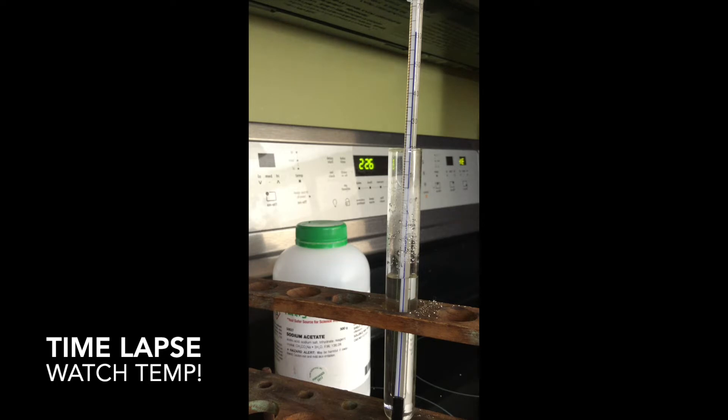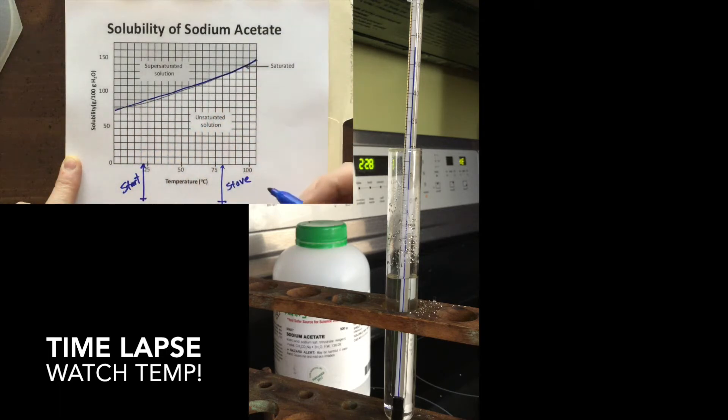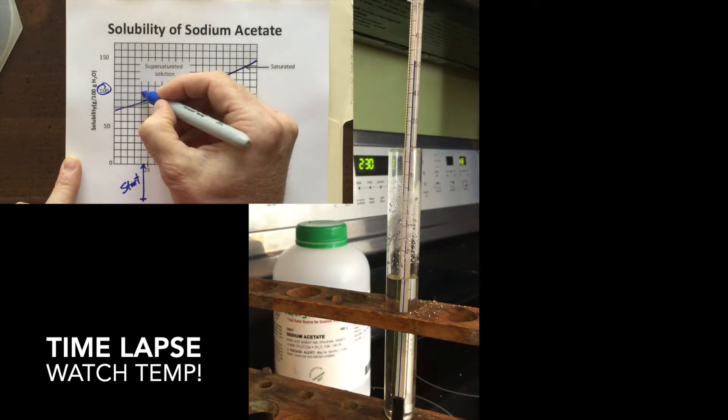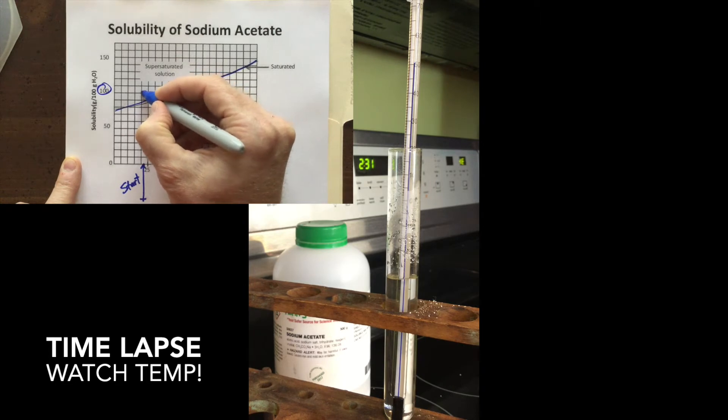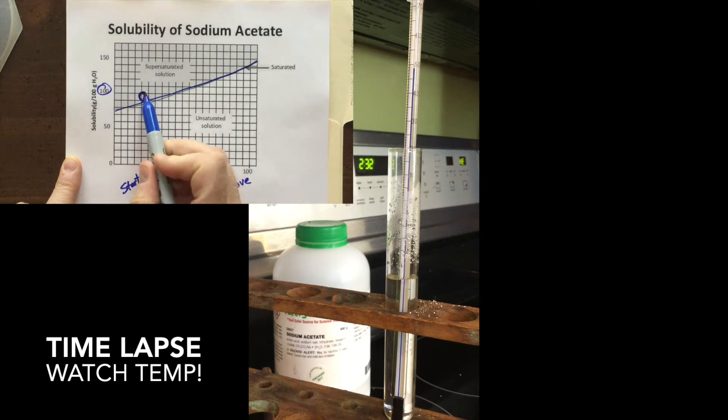And while we slowly let that cool down, let's take a look at a solubility curve for sodium acetate. This curve is the same curve that we are dealing with. As we talked about this curve, we started here at about room temperature. And when we put that sodium acetate in there, we saw it did not dissolve. If we said that we had 100 grams in there, we would have been right up about here. You would have more salt than you could actually dissolve. So we realized the only way we could get this salt to dissolve is we had to move this way and we had to heat things up.